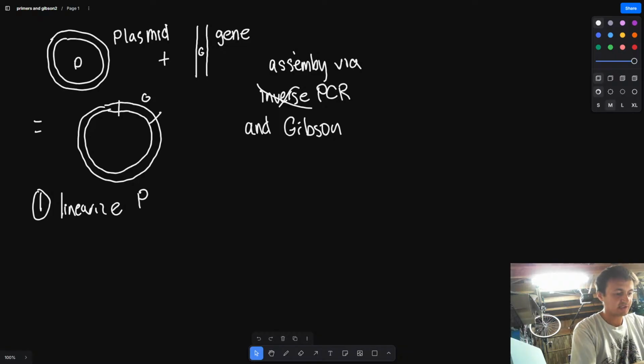Okay, so I'm going to draw a section of DNA.